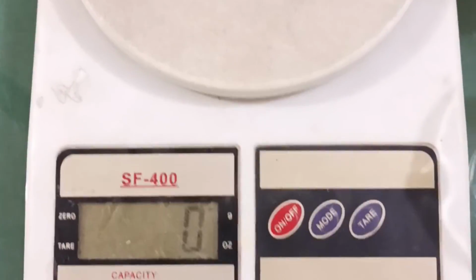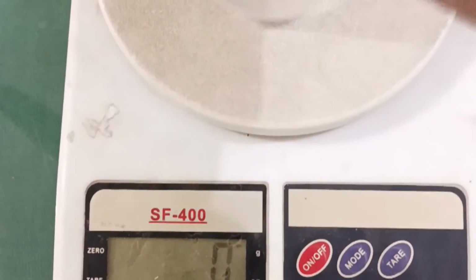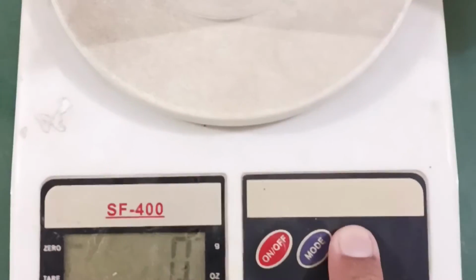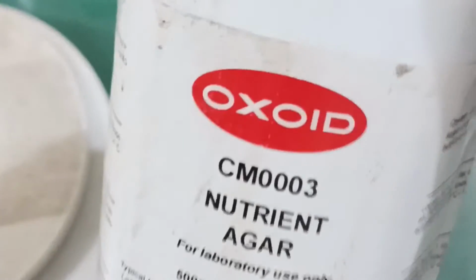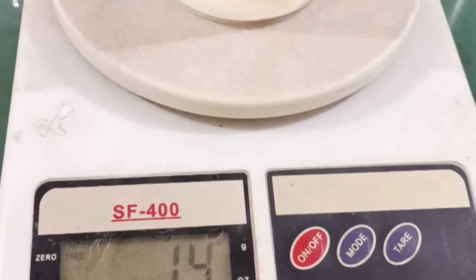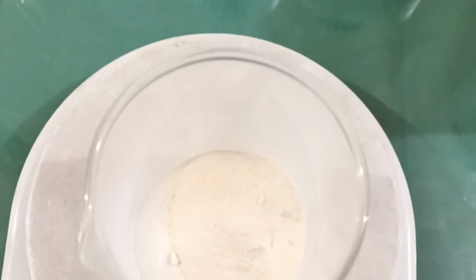This is the physical balance, and we are taking this beaker. This is 101 grams, so tare it, and it will become 0. Now put 14 grams of the nutrient agar as we have calculated. So I have put 14 grams of nutrient agar in this beaker. As you can see, this is the nutrient agar.